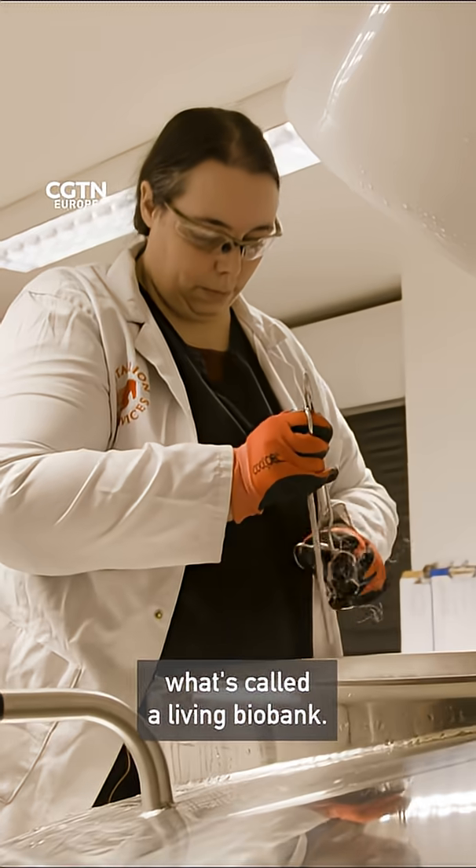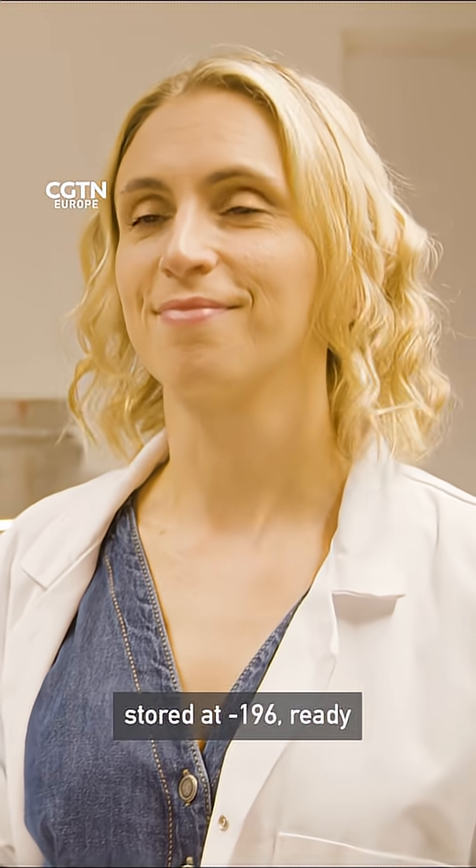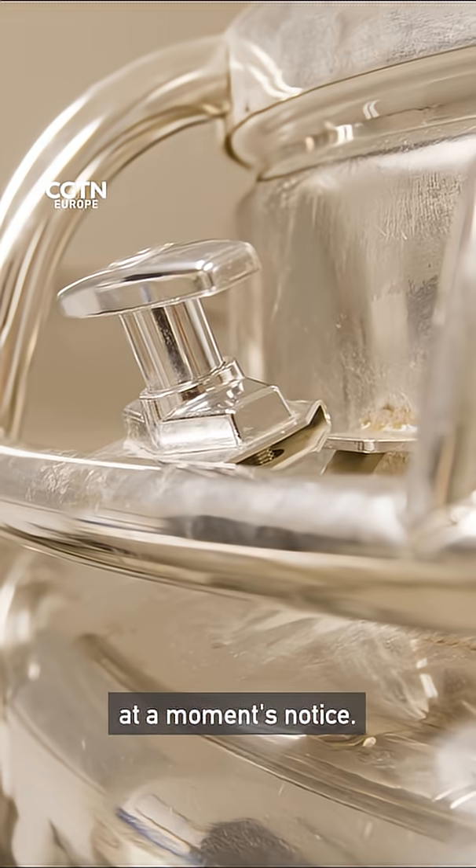This is what's called a living biobank. This is the tank room where these amazing animals that we've saved are frozen in time, stored at minus 196 degrees and ready to be brought back to life at a moment's notice.